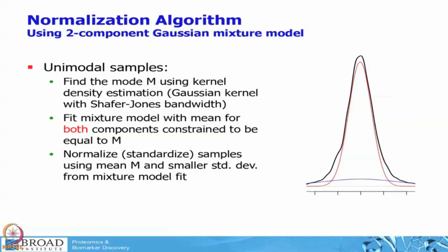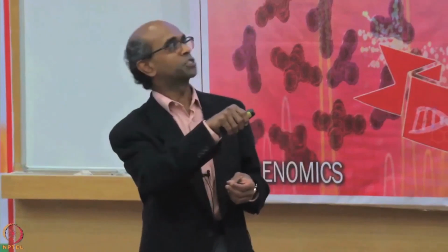I want to find just those proteins in the middle that are not changing. So that means there are two distributions in my black line. One represents proteins that are not changing, and another represents things that are changing. And so we fit two different Gaussian or normal distributions using a process called mixture modeling.